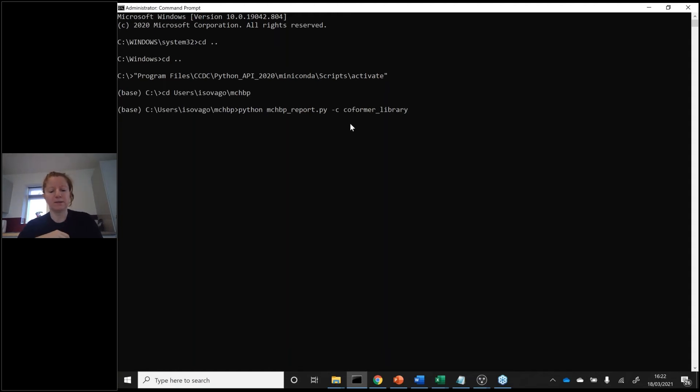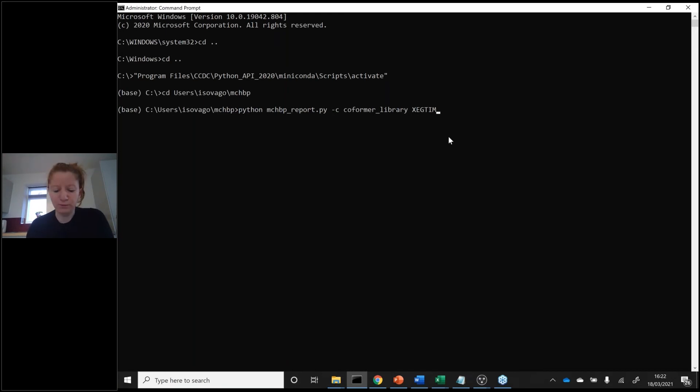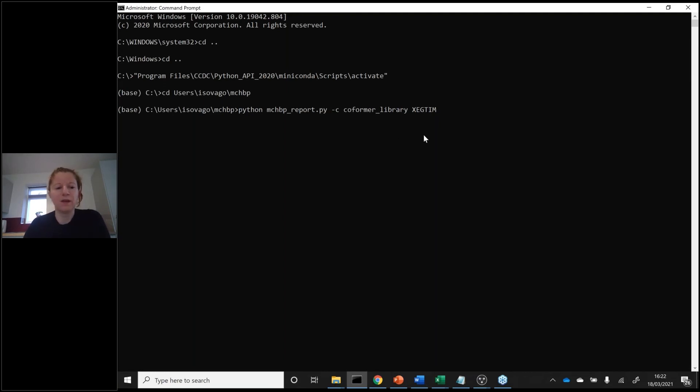Then you type, if you have a mol file in that folder or CIF file, you just type the name of that. Or in this case, if it's a refcode, you just do that and then you hit return.